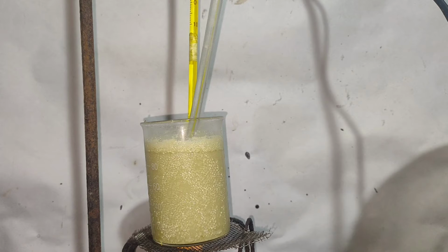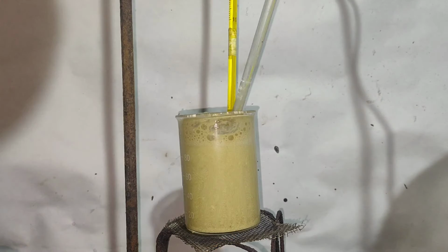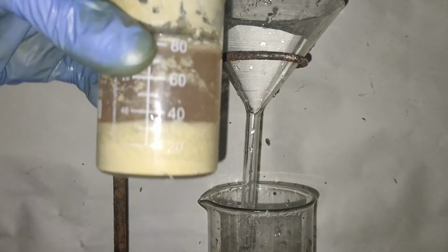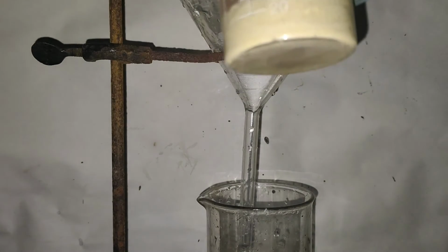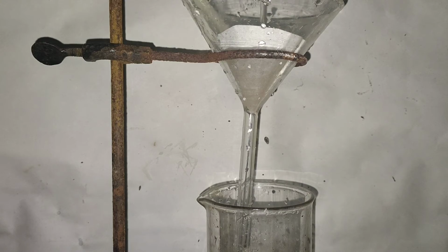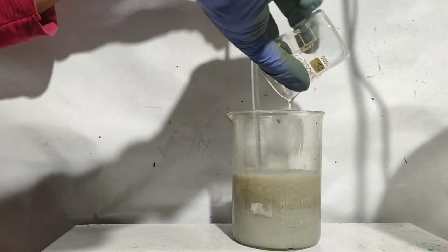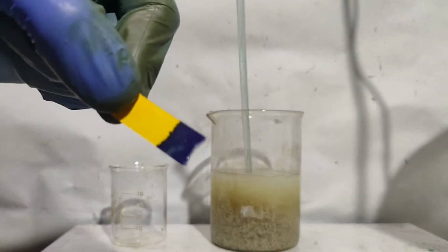On heating, a smell of sulfur dioxide was observed from the reaction mixture, which means that sodium dithionite had not been washed out completely. So I boiled it for a minute to expel all the sulfur dioxide, and then I filtered the solution after it became just warm enough to hold, and then to the filtrate I added sodium hydroxide solution. This time an off white PPT was formed. I checked the pH and it was highly basic.